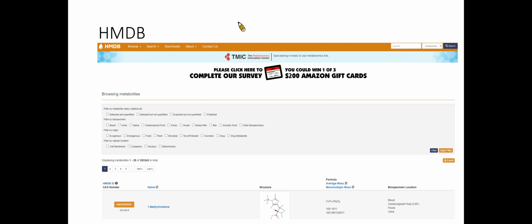Each MetaboCard entry contains 130 data fields, with two-thirds of the information being devoted to chemical and clinical data, and the other one-third devoted to enzymatic or biochemical data. Many data fields are hyperlinked to other databases and a variety of structure and pathway viewing applets.